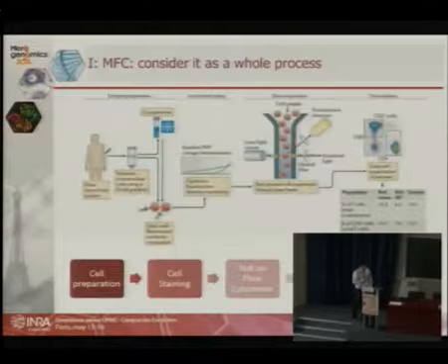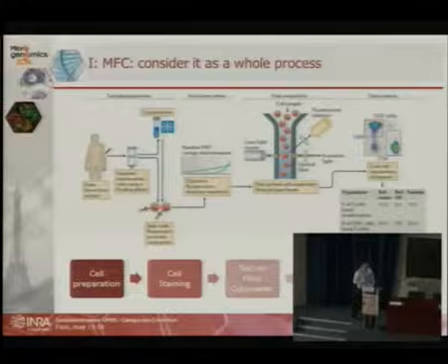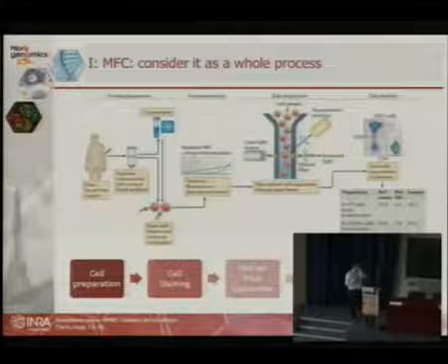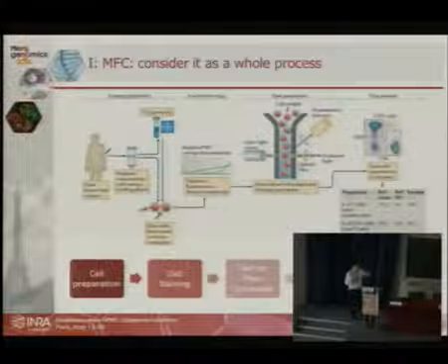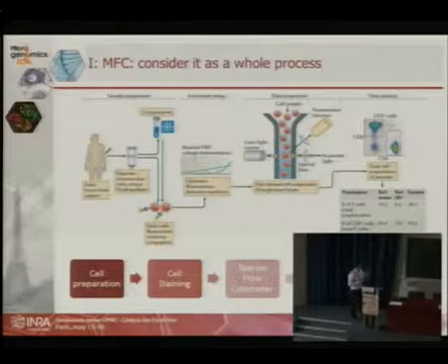One of the things also is that by adding a lot more markers than what people used to do in conventional flow cytometry, I'm not talking about 6 or 8, I'm talking about 12, 15 or even more, you actually bring a lot of robustness to your data set, because it's kind of correlation like in a geographic map. You have many, many coordinates that makes that at the end, if you sort the cell that fulfill all the criteria you are giving, then you increase the chance that you have the right cells.